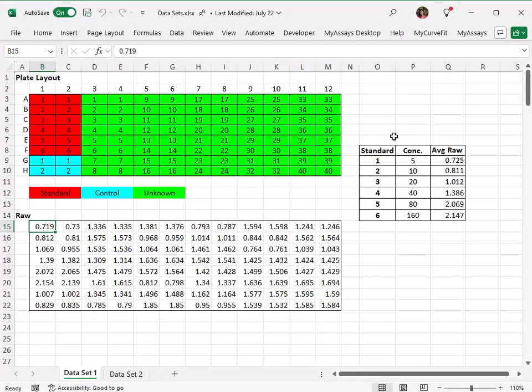In this video, we'll go over how to select which fit method to use for your ELISA, helpful tools available to compare fit methods, and introduce a new tool available on myassays2.com that can assist with making that decision.